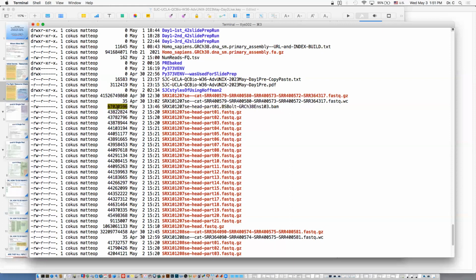And it's actually bigger than the input, which isn't really a surprise because most aligners make the entire input also be part of the BAM file output. Because a BAM file is basically the same as the input with extra information about where on the genome the things go. So the output includes a copy of the input. So it's not a surprise that it's bigger, even though they're both gzip compressed. BAM is a binary format, internally gzip in a special way, so it doesn't get a gz extension, but it is basically gzip inside.